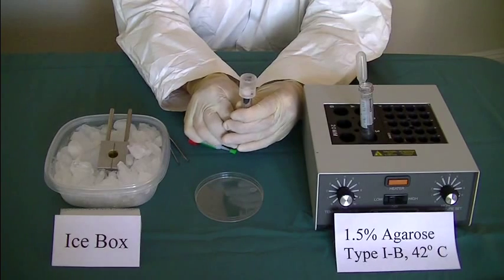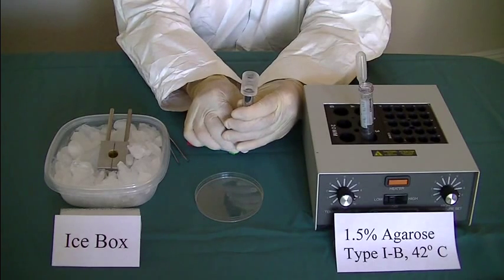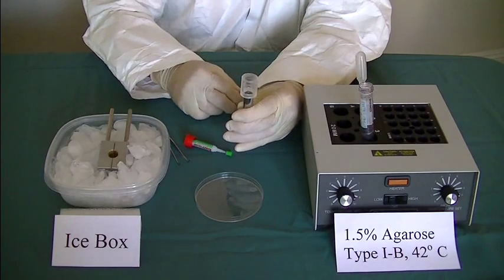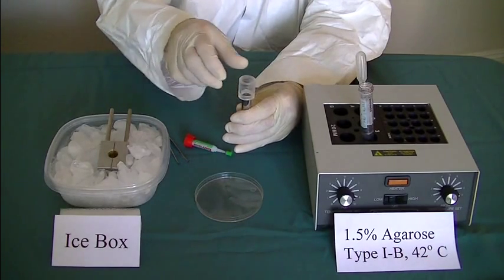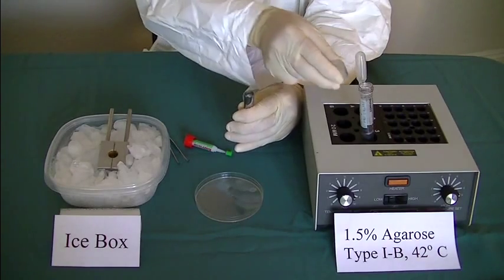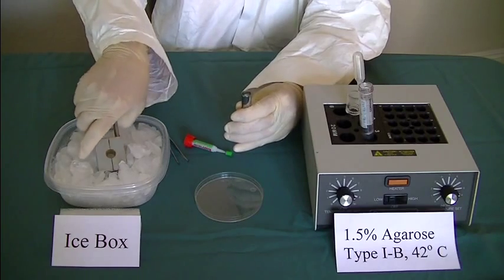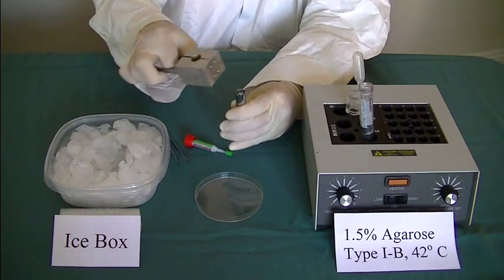Draw tissue into the specimen syringe. Remove embedding ring. Chill the specimen syringe with chilling block.